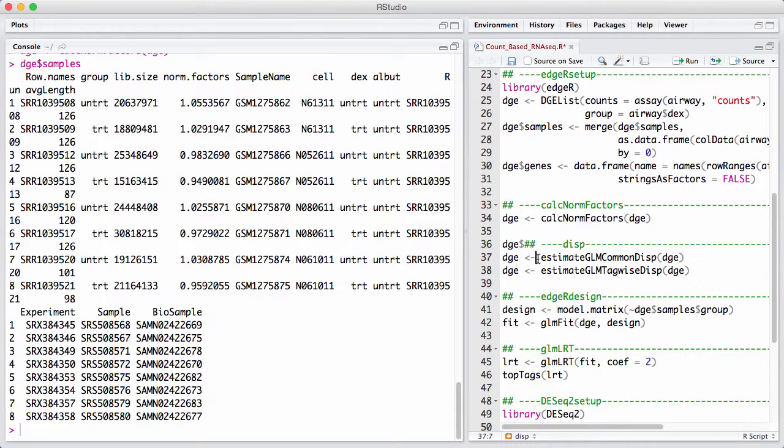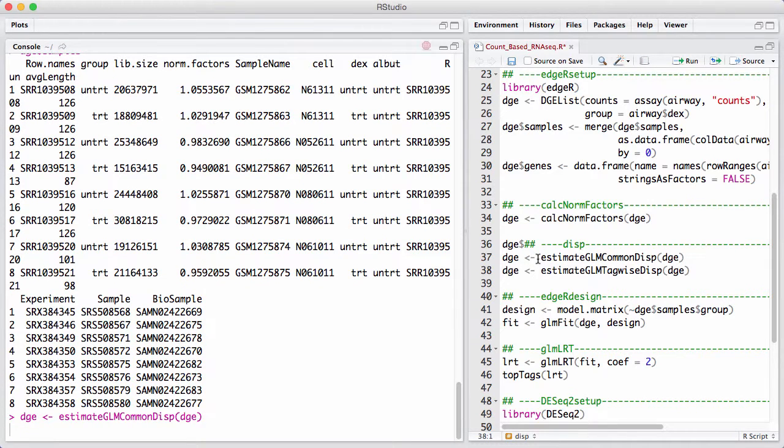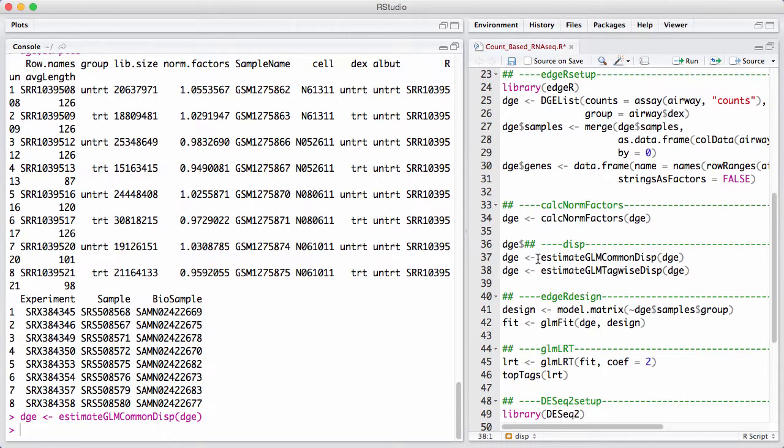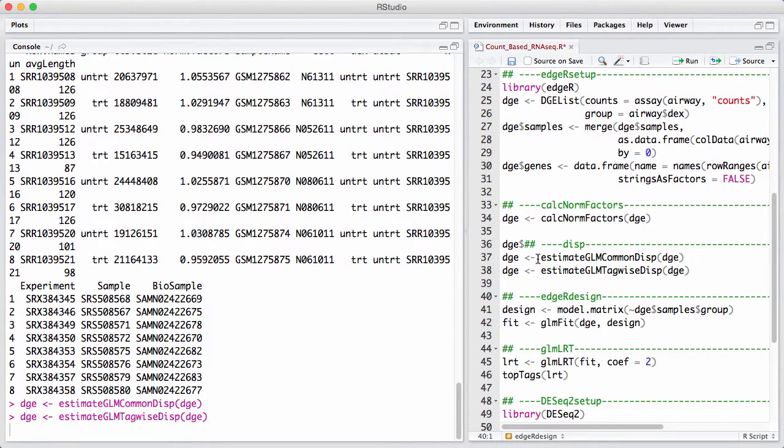Now the next step we do when we fit an edgeR model is that we estimate the dispersion or basically the variability of the data. And we do that in two steps. We've got to estimate something called a tag-wise dispersion. And in order to do that, we first have to estimate a common dispersion, that's assuming that the dispersion for all genes are the same, which is probably unrealistic. And then once that's estimated, we can estimate a tag-wise dispersion. It looks a little weird that we have to call two very similar commands after each other, but this is intentional. So now we have estimated the effective library size, we have estimated the dispersion parameters, and we are ready to do some model fitting.